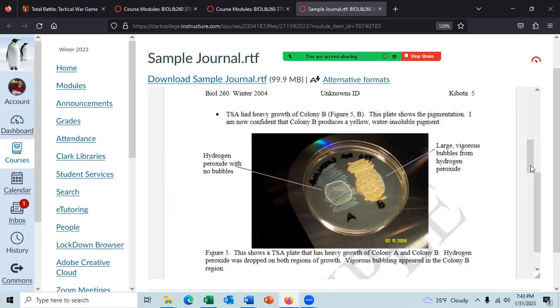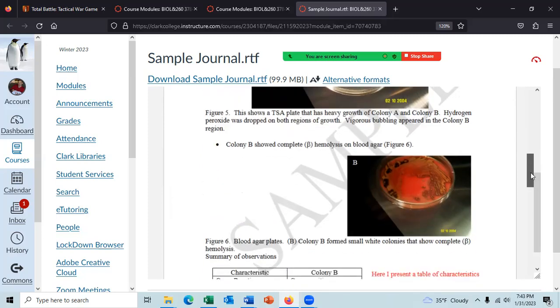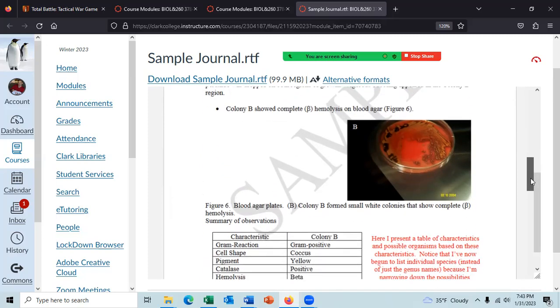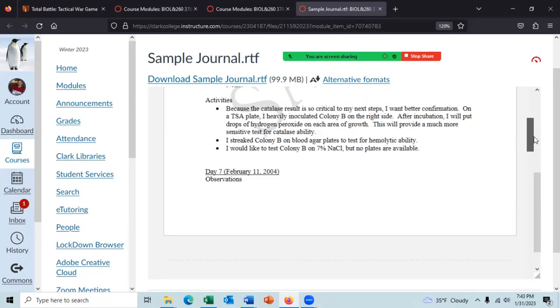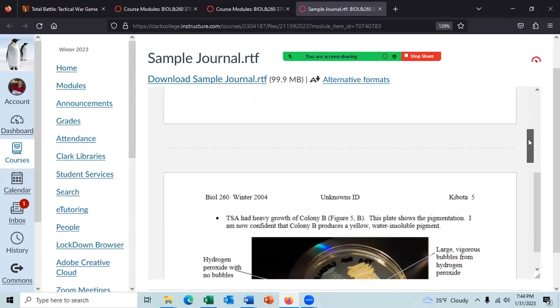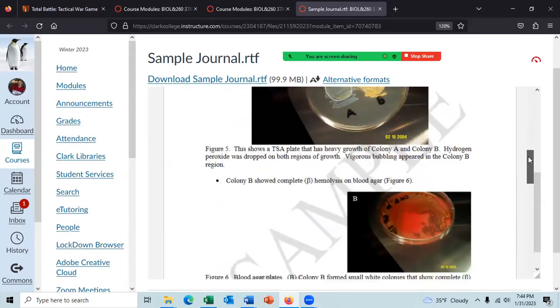No, that was earlier. He gave that earlier. Let me see. What was the test he ran? 7% sodium chloride. I don't see the results for the 7% sodium chloride.